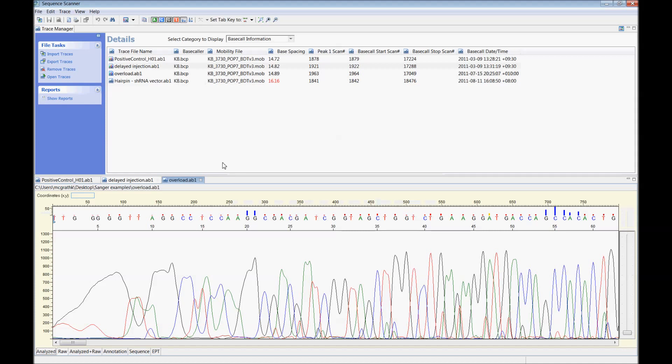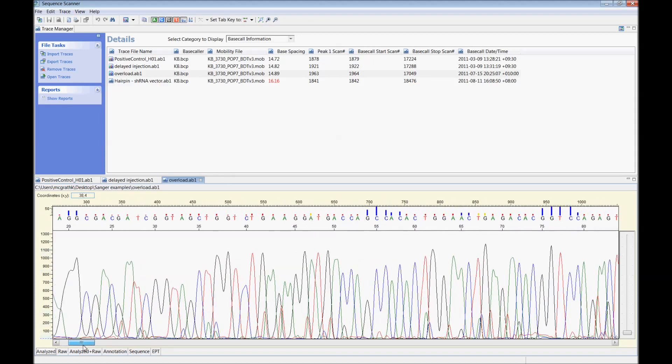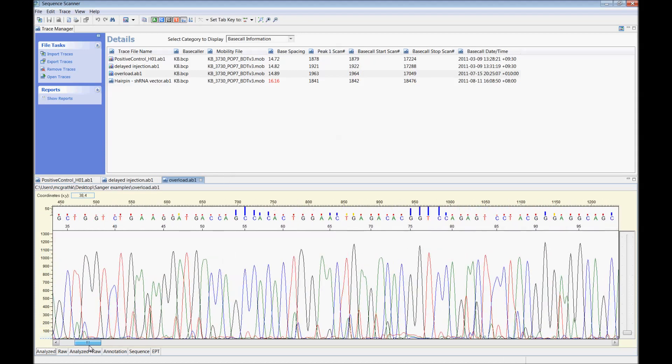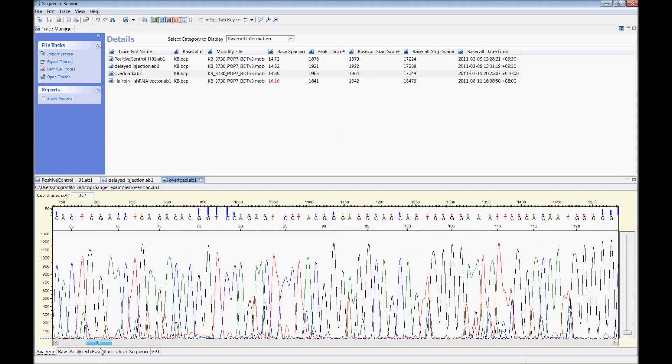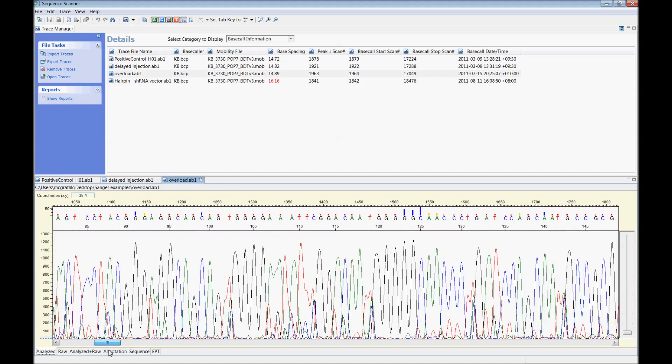This overload example shows what happens when too much template is used for sequencing. The signal that is generated is very bright and it overloads the machine's ability to detect the peaks. These overloaded sequences are messy with very low quality base calls.